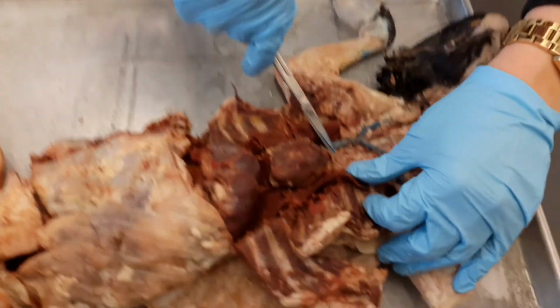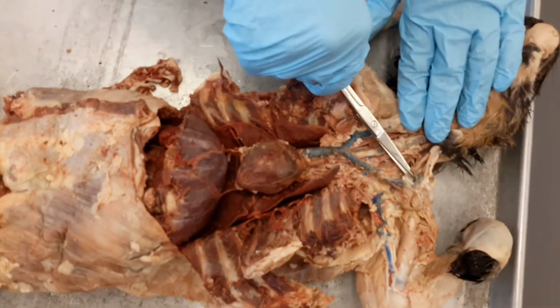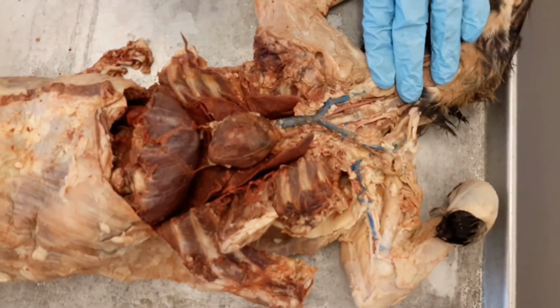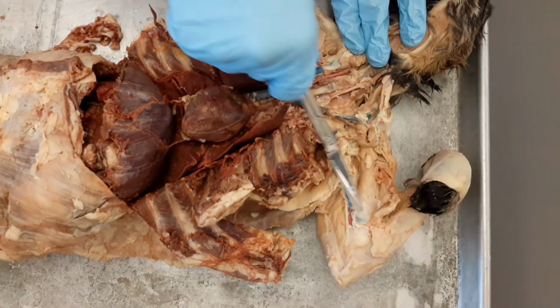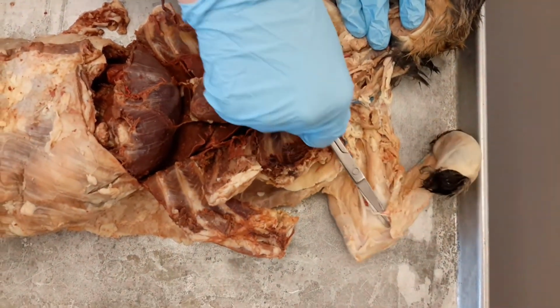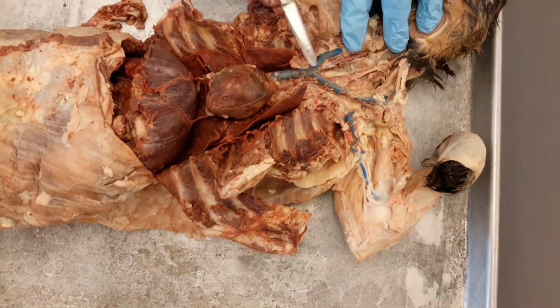Now you're going to have to really dig to get to the arteries, okay? If you've had me before, you know I like to use the point and spread technique. Using your scissors, put them in together and then spread, and that way you're not going to cut something you don't want to. Be really careful up here.